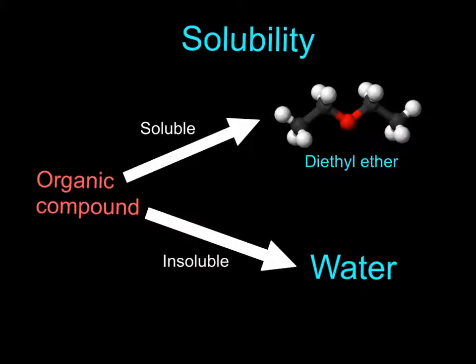So let's get some background about extraction. Extraction is widely used in nuclear processing. I got this from Wikipedia. Extraction can be used in the production of fine organic compounds, the processing of perfumes, the production of vegetable oils, and some other industries. The unknown I have today might contain organic compounds that have acid or base functional groups, like carboxylic acids and amino groups.